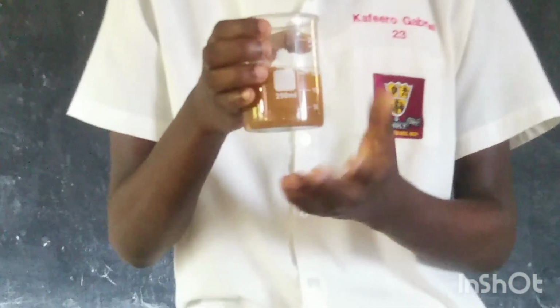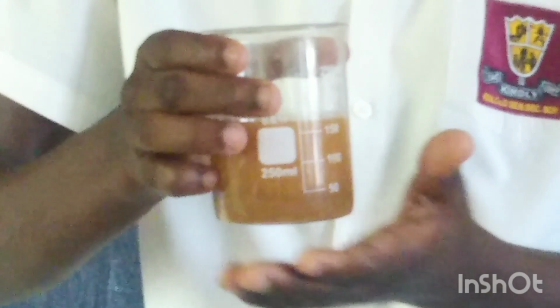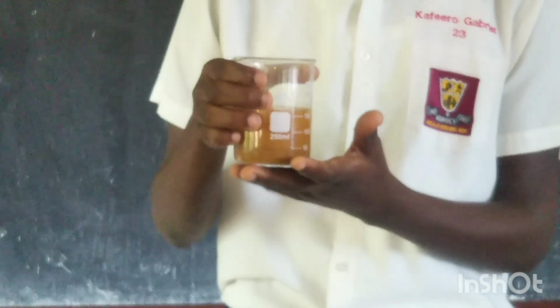Remember, the process I'm talking about today is decantation, and for this decantation I'm going to use sand and water. After getting the water that was in the beaker and the sand that was also in the beaker, I mixed them up. After mixing them up, I just stirred a little bit, so for my sand to get a little bit mixed with my water.